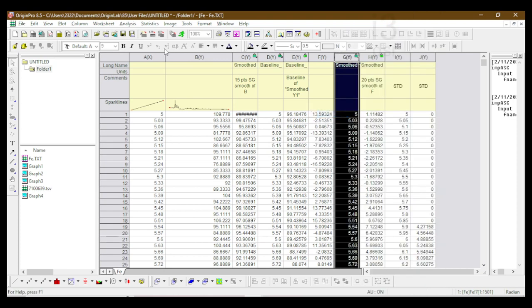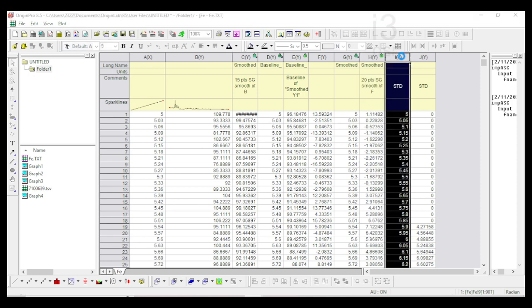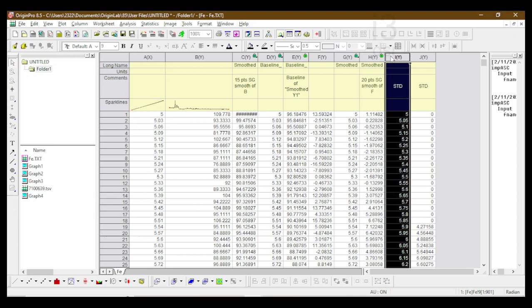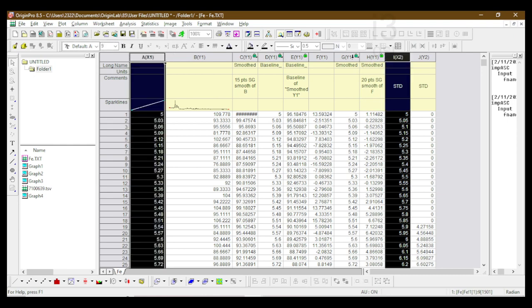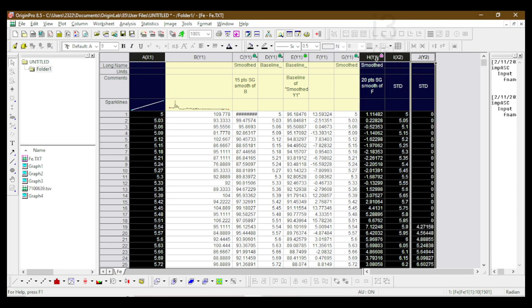So that now I am plotting x with y, and this should be an x. I'm doing it plot as x. So now this is x1 and y1, x2 and y2. I'm going to copy this, x1, y1, x2, y2. Yes, all these are copied.